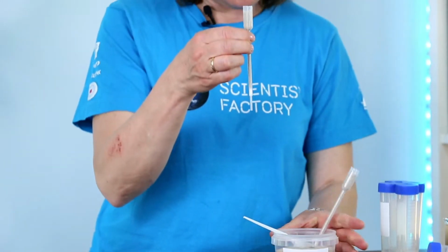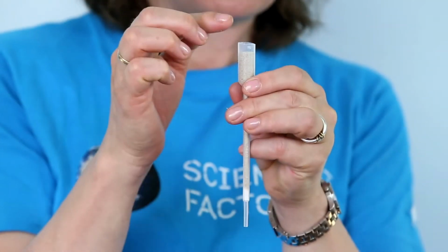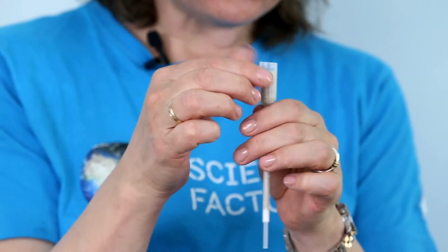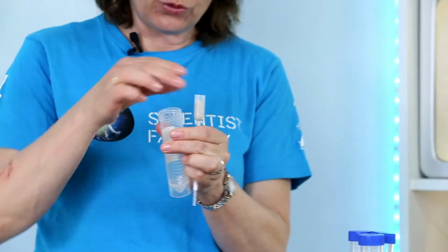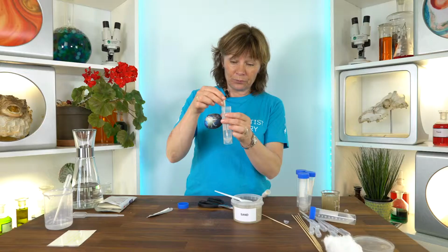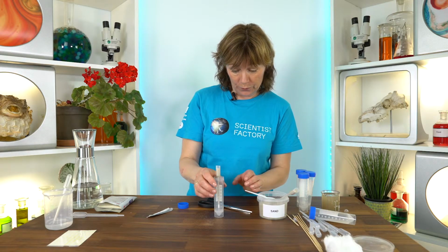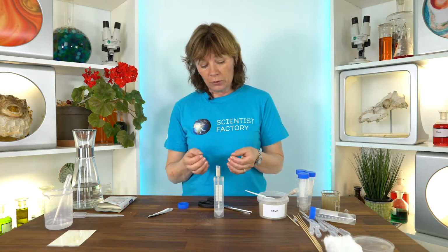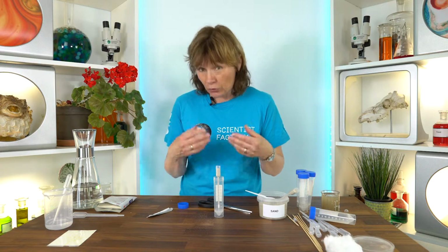And keep a little room left on the top so you can have some space to add water. And when we purify water, we will send it through this column and into a clean tube. So this is the way to purify water. But as I said, maybe your students want to have other ideas.